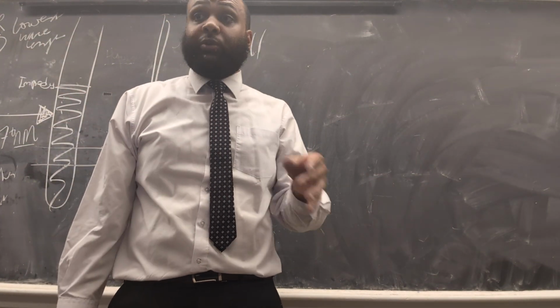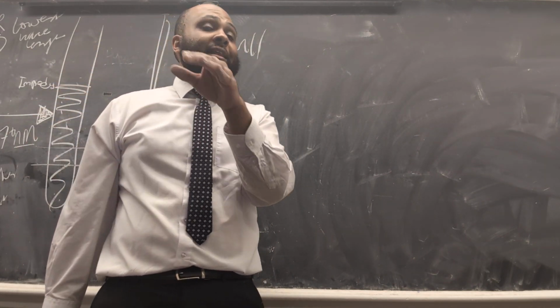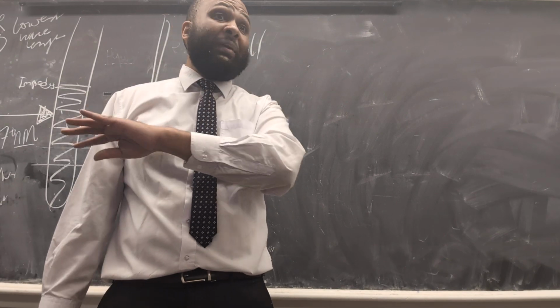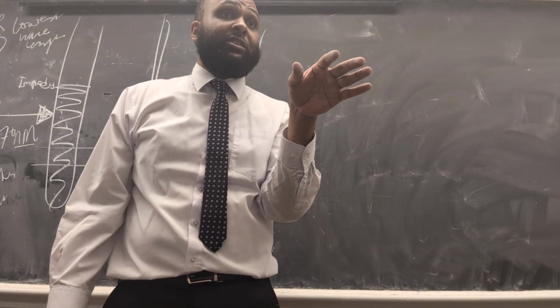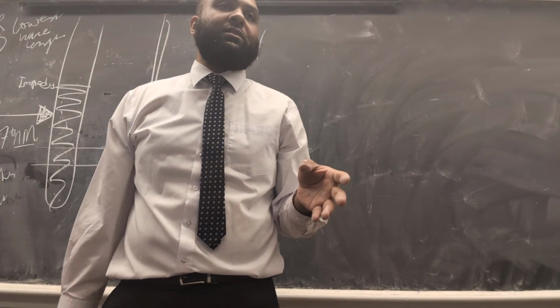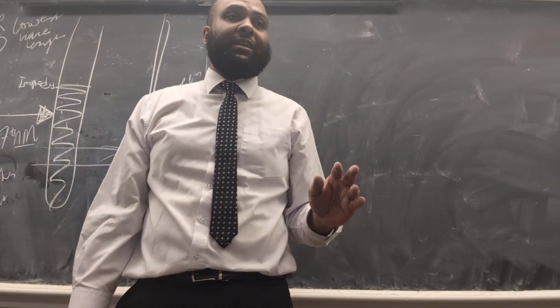If you change pH, the null hypothesis here would be that the product and the absorbance and the transmittance will be the same no matter how the pH changes. If it's pH 3, 4, 5, 6, 7. That's the null hypothesis. It means that the thing we're testing is not significant.